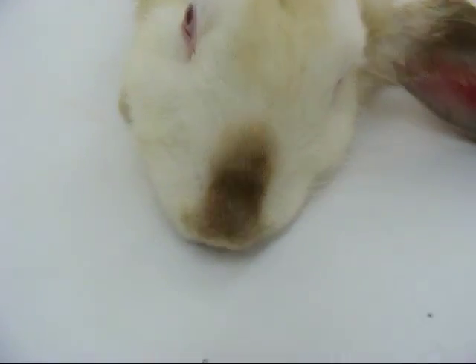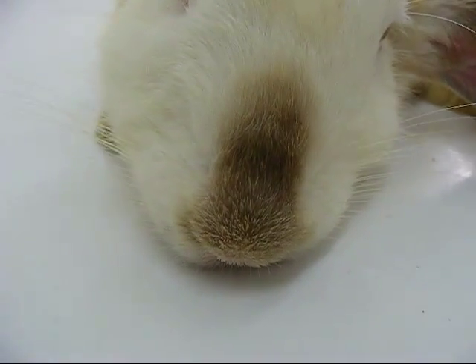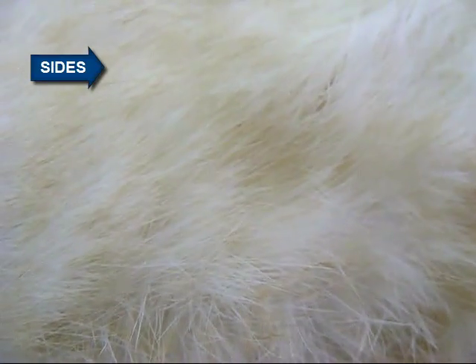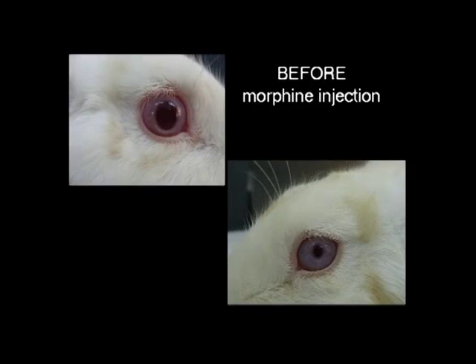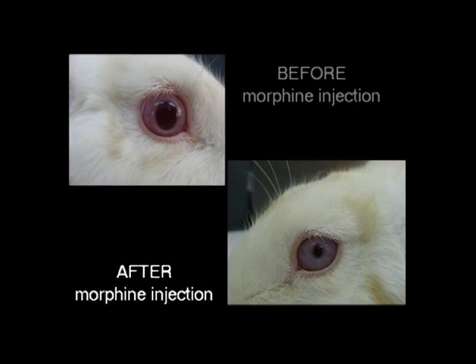Observe the rabbit for respiratory signs and determine the respiratory rate after drug administration. Observe the pupil size again. Morphine causes miosis, that is constriction of the pupil.